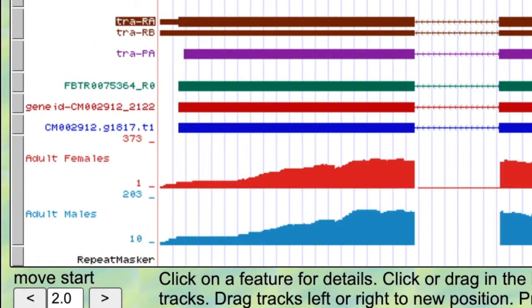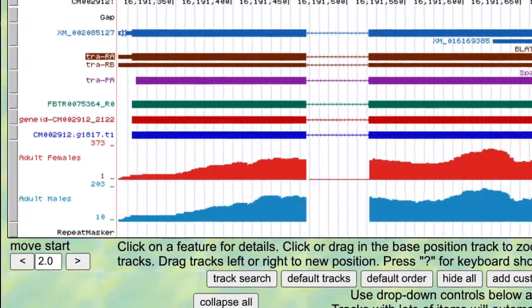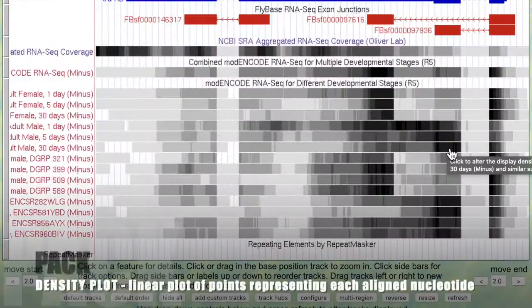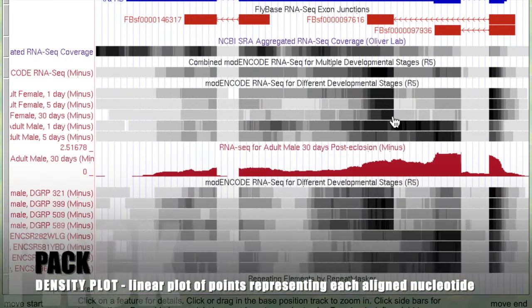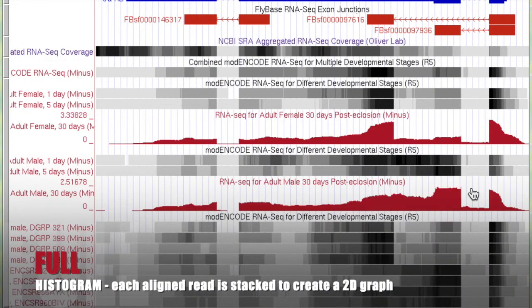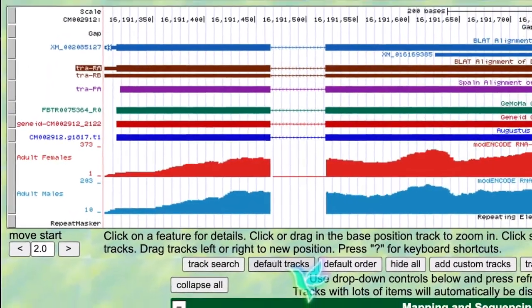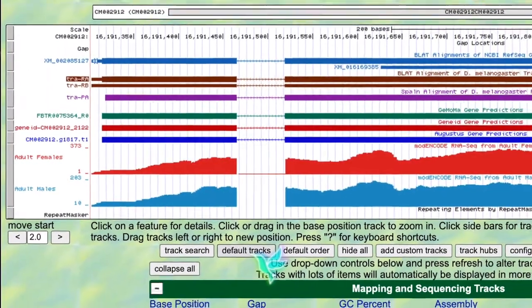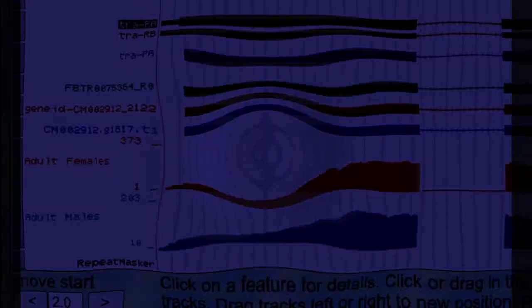Once you're here, you'll see the RNA-seq track usually located at the bottom of your window, depicted as a histogram, with heights proportional to the number of reads per million mapped reads for each individual nucleotide as you go along the track. But before we go any further, in order for us to best understand RNA-seq, we ought to know how it's obtained.